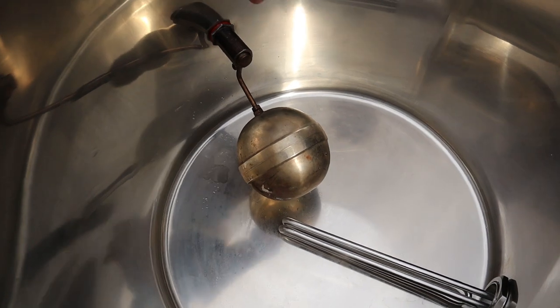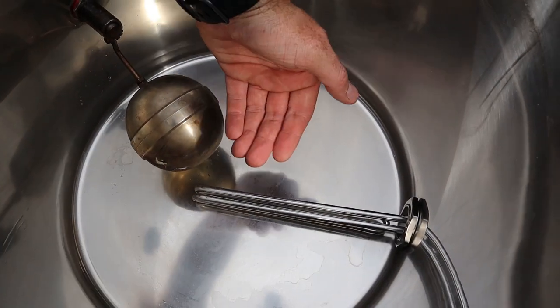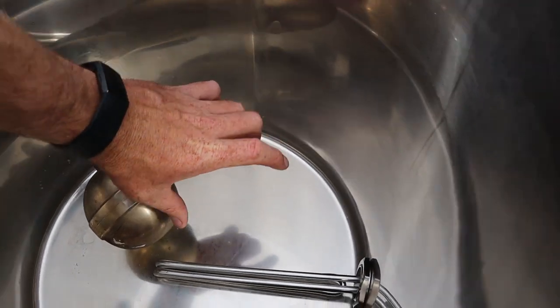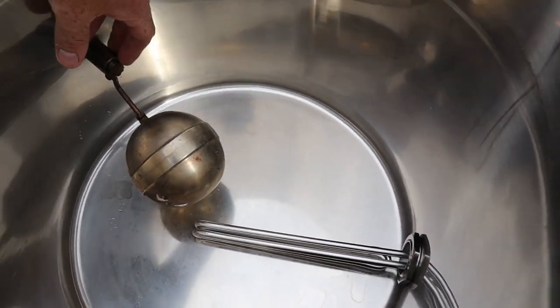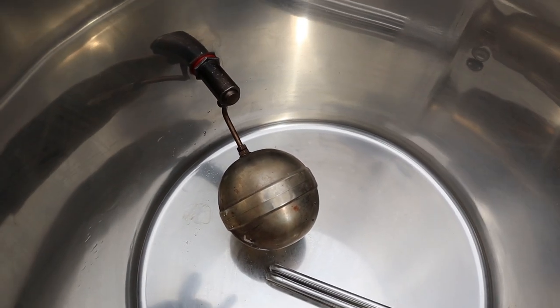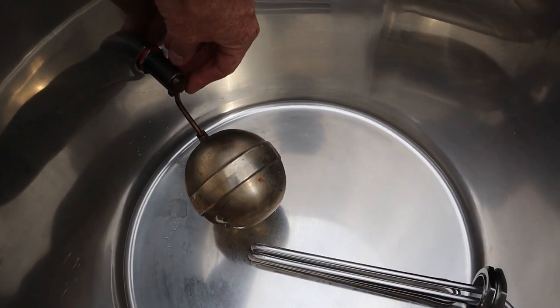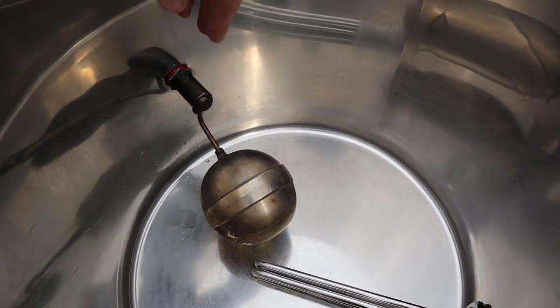Here's the float valve sitting just above the element. It should fill the water supply to about that depth, which should cover the element nicely. This float valve was actually from the barrel that nearly went up on me — that's why it's all charred. It got quite hot in there but surprisingly it still functions and didn't destroy any of the seals, so I'm pretty happy about that.